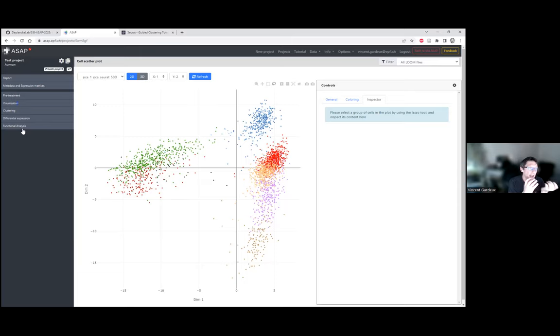So I guess this option is good if you want to verify something or if you want to compute a specific DE. But that's not something that you would use in the end for the annotation, I would say. So the annotation, I would still do it on the main clustering results. Even if you need to annotate the cluster as two different ontology terms, so that's something you can do. But I agree, it's not dangerous. It's more like it's biased, I would say.